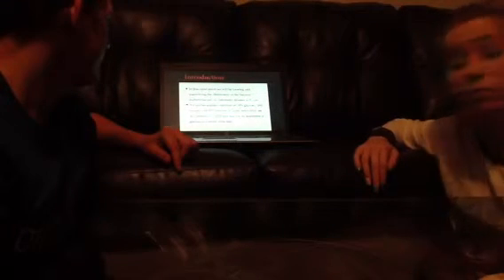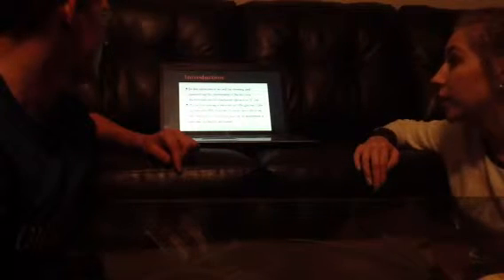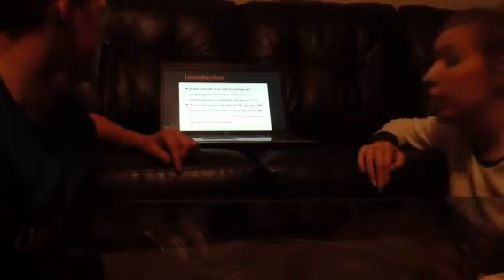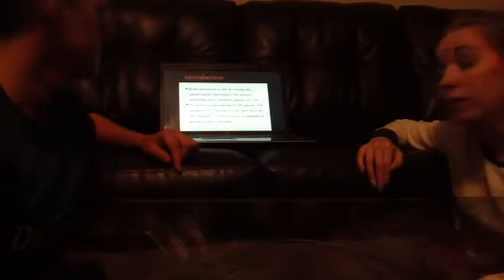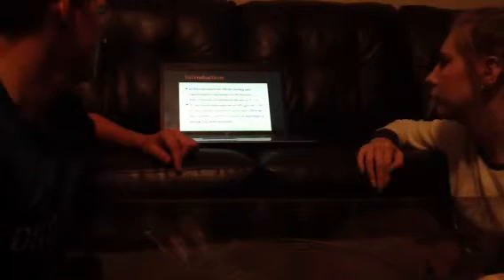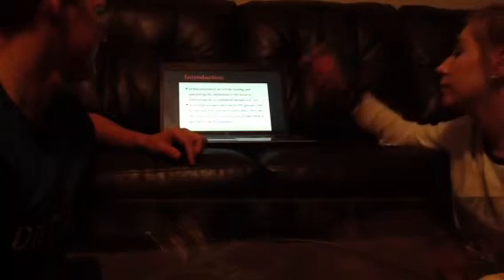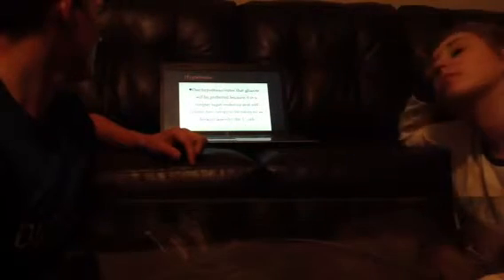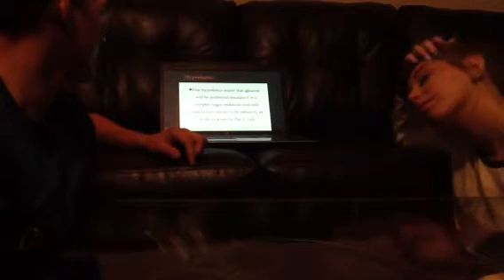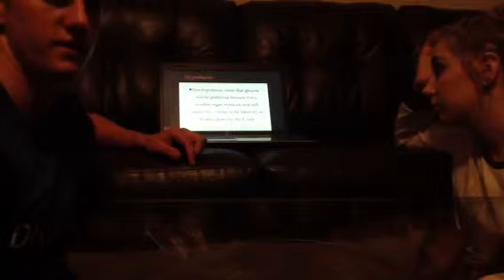In our introduction, we mentioned that in our experiment, we will be viewing and quantifying the chemotaxis of the bacteria E. coli. We will be testing a solution of 20% glucose, 20% fructose, and 20% lactose to study their effect on the chemotaxis of E. coli to determine if glucose is a better attractant. Our hypothesis stated that the glucose will be preferred because it's a simple sugar molecule, and it's going to require less energy to be taken in or broken down by the bacteria E. coli.